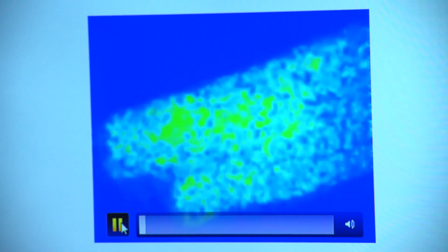There we go. So what you can see here is a single beating heart cell. And the change in colour that you can see is actually a surge of calcium within the cell. So the heart relies on electrical signals to coordinate its beating, and so it operates like a very strong muscular pump. But when those electrical signals reach each individual cardiac myocyte, as we call the heart cells, there's a surge in their calcium concentration, and that surge causes them to contract, and you can see that cell contracting just from that edge moving in.